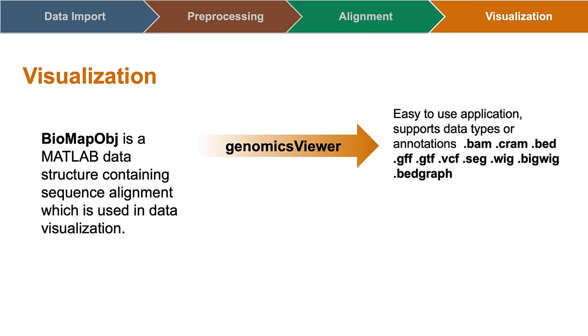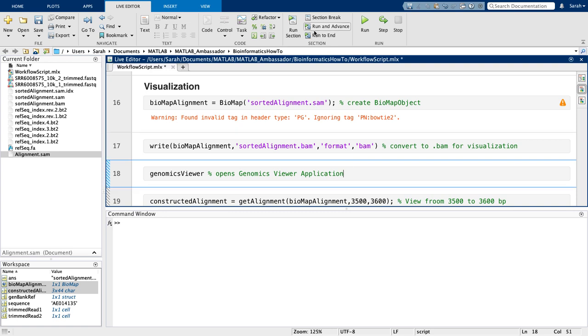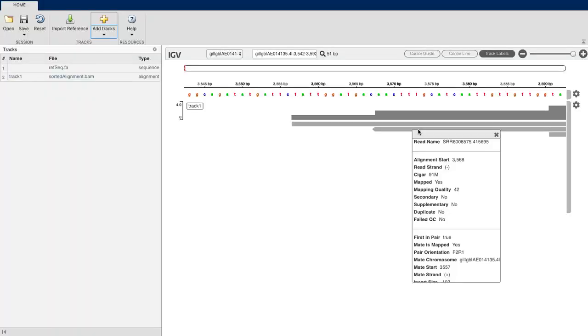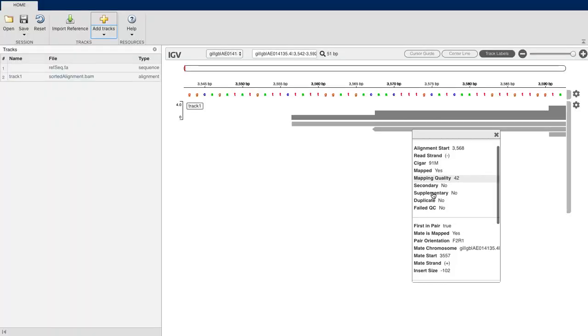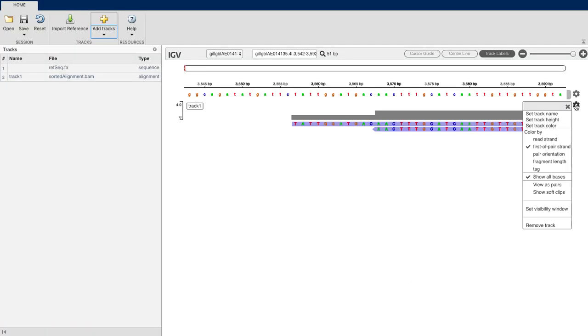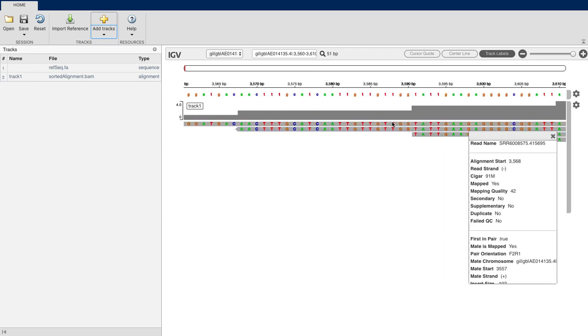There is a built-in app, Genomics Viewer, allowing for alignment visualization, as well as other annotations, like GTF format. To view this alignment within the app, I must first convert my alignment to BAM format using the function Write. Then, I can easily import my reference and alignment track and explore the information. I can zoom in and out and inspect base pairs and change features, such as coloring, however I would like.